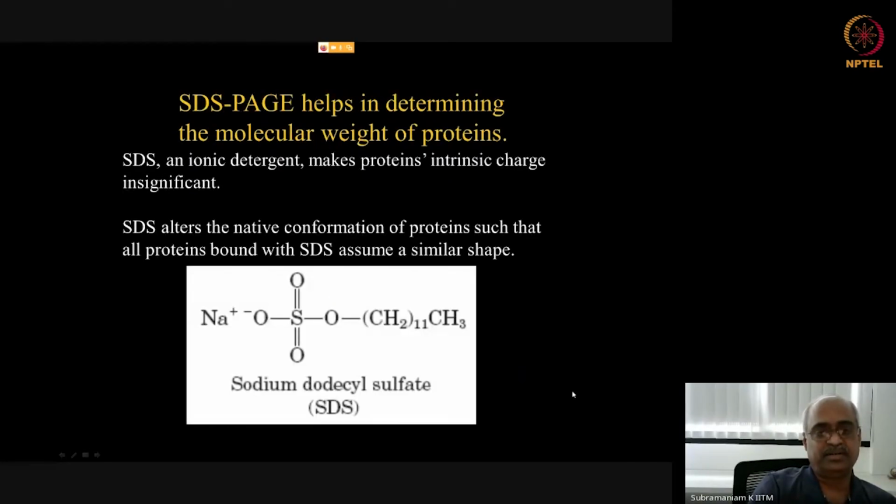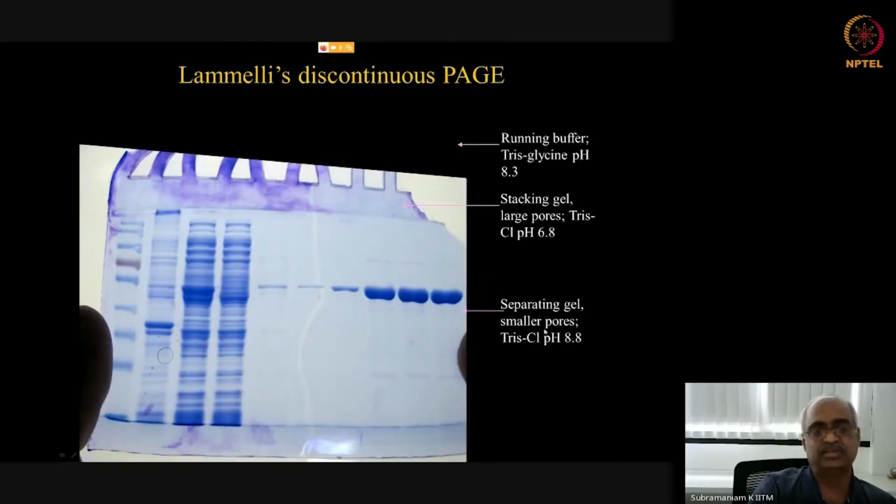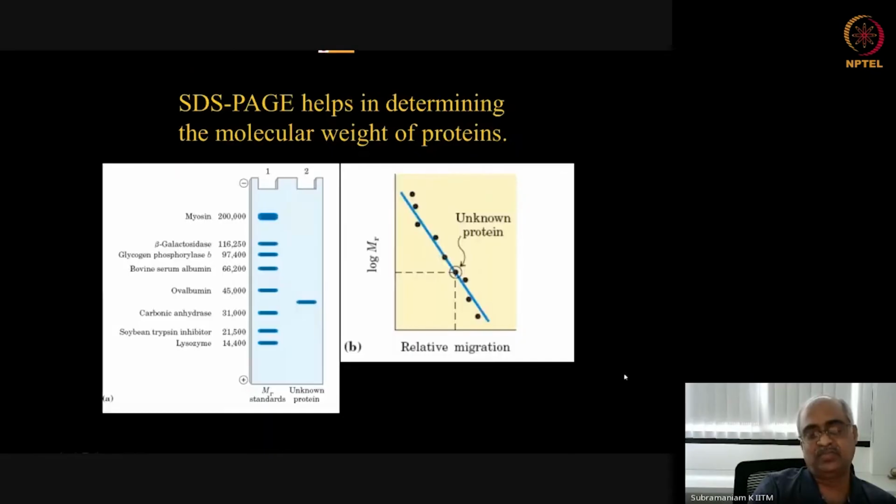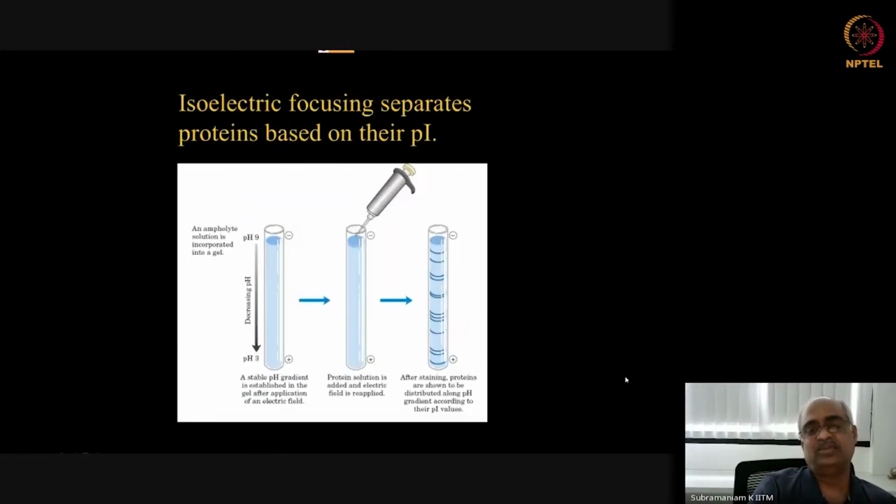So now to circumvent this issue of not being able to separate all proteins, we exploit two distinct properties of proteins. So here we are exploiting the molecular weight differences among the proteins for separation. Then we already know, depending on the kind of amino acid sequence a protein has, its isoelectric pH can be varying. And I told you the isoelectric point, or pI, is the pH at which a protein's net charge is 0, which means that protein is not going to move in an electric field if the gel pH at that given position equals its pI. So that is in no way related to its molecular weight. It is a completely independent, distinct property.